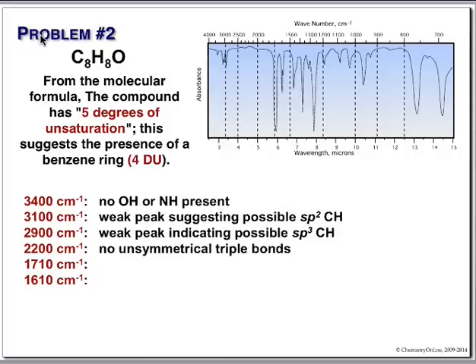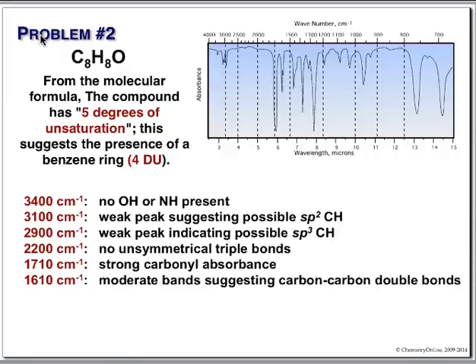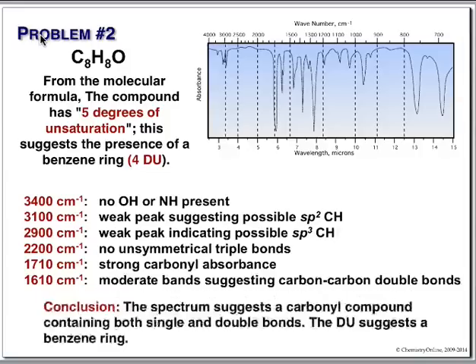Once again, we have a beautiful carbonyl at 1,700. At 1,600, nice sharp peak, and it's got some friends here, 1,400 and above. That is consistent with benzene, sp2 carbon-carbon double bonds. So what we say here is this looks like we have a benzene ring. We have a carbonyl compound, it's a ketone. We have single and double bonds.